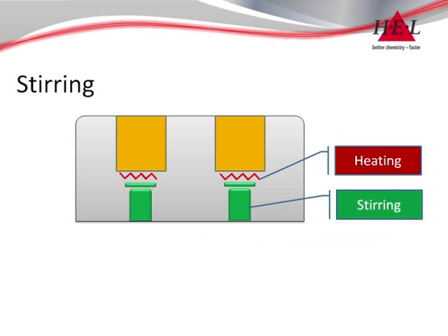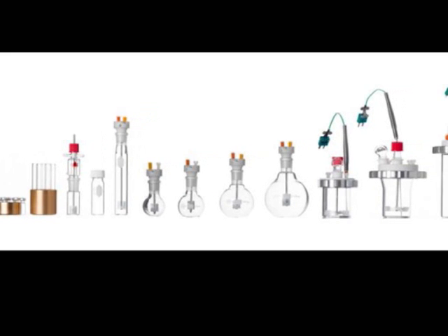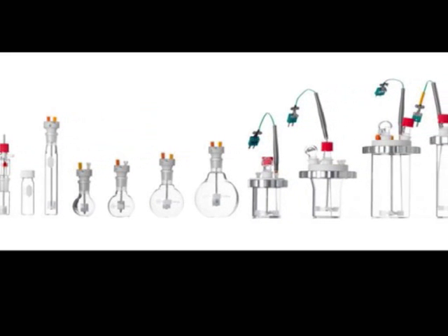The powerful stirrer motor is located directly underneath each reactor position and couples with magnetic fleas or suspended magnetic stirrers inside the reactor. Magnetic fleas are adequate for simple operations in smaller vessels.